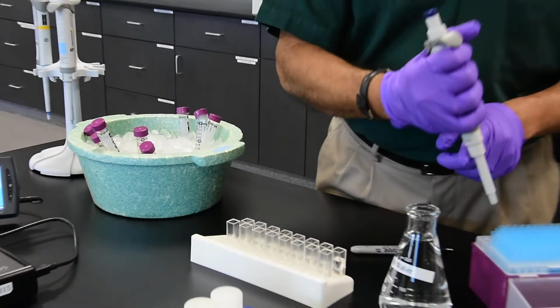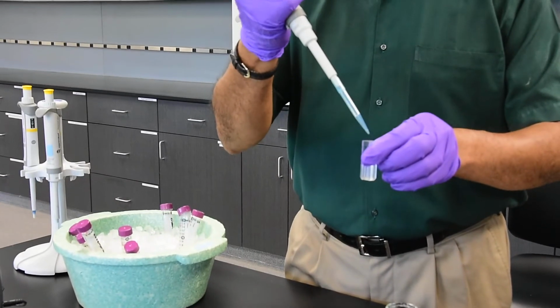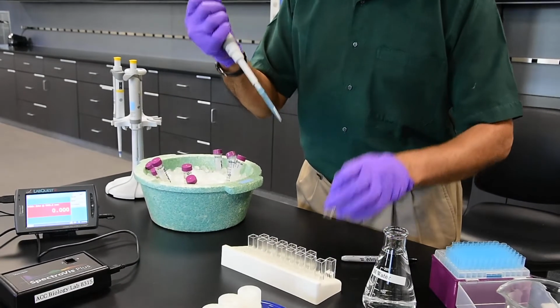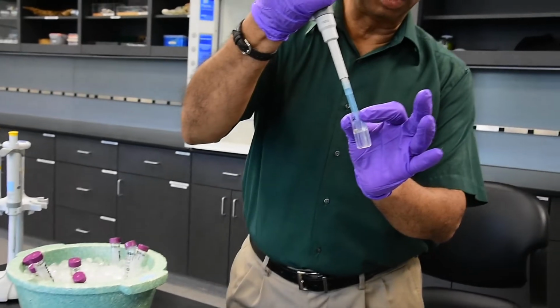Okay. So now I have added 1 ml water to each one of them, and then I'm going to take a fresh tip, and then I'm going to go to the first tube, which has 2 milliliters. I'm going to take 1 milliliter from this and move it to the next cuvette. Okay. So here, this one I'm mixing.